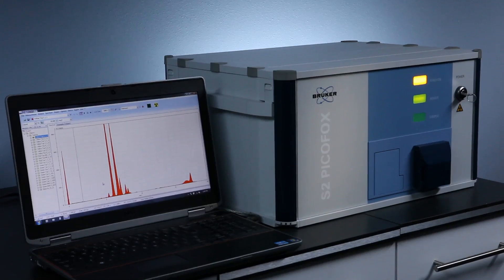The footprint of this instrument is relatively small. In fact, it's about the size of a microwave, so it takes up very little bench space.